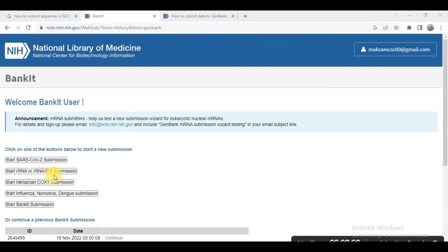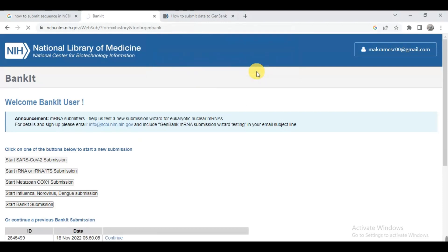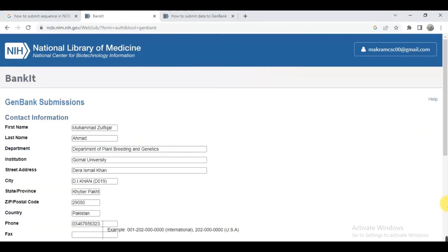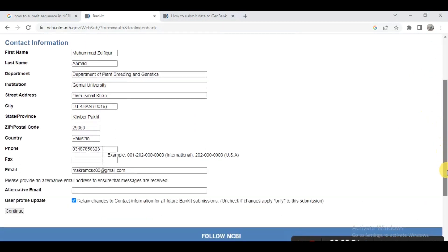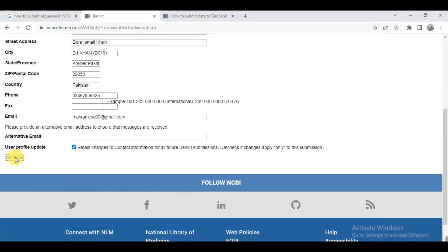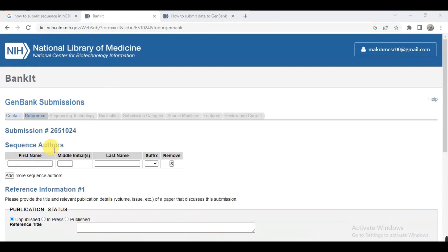After that a second window appears — click on 'Start BankIt Submission'. This will discard any incomplete submission, so click OK. I have already tried it and entered my data, so it appears here. You can give all your details here, and then continue.